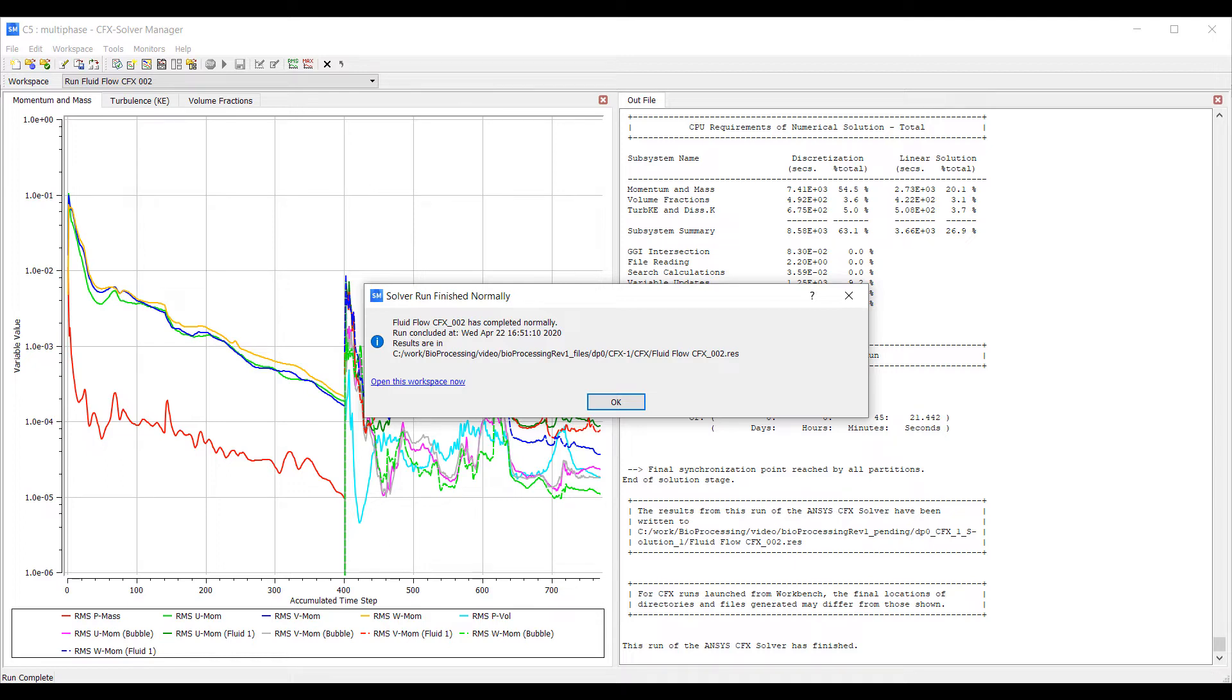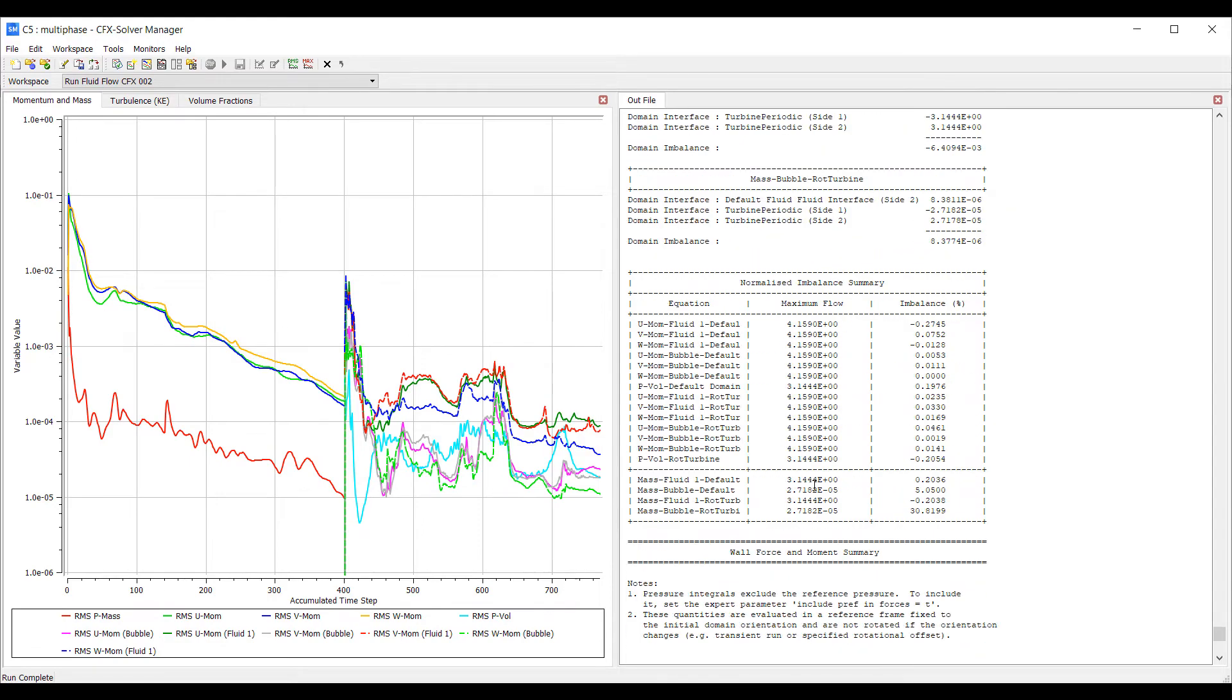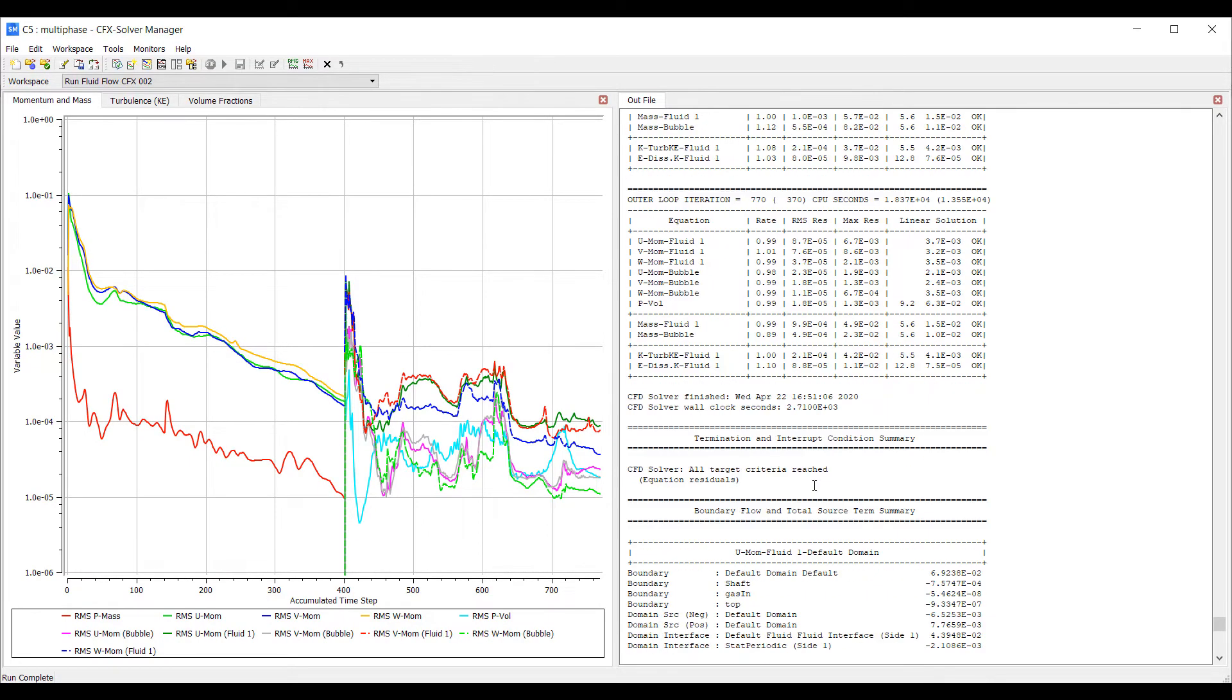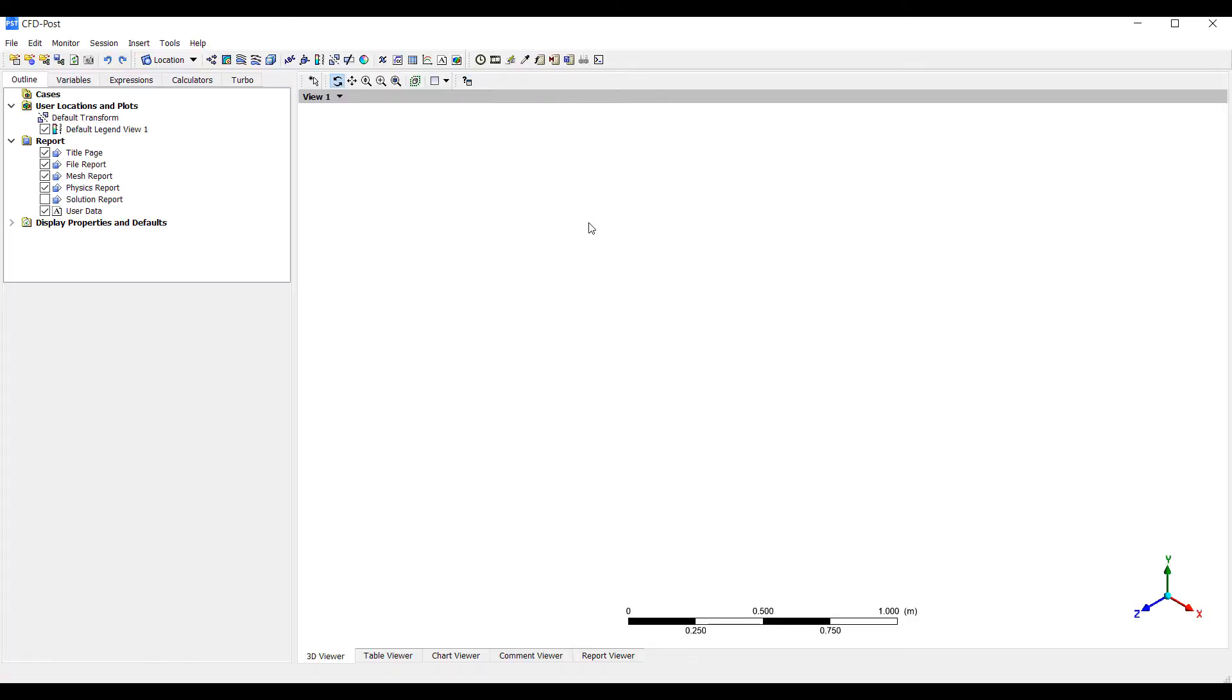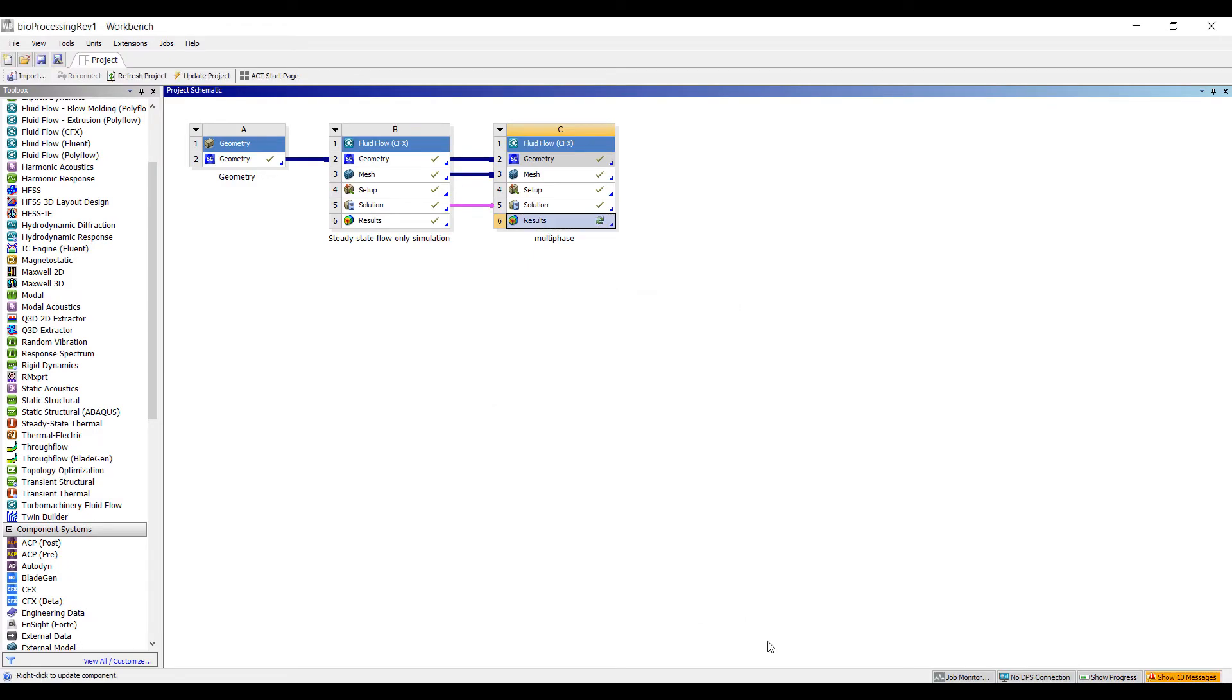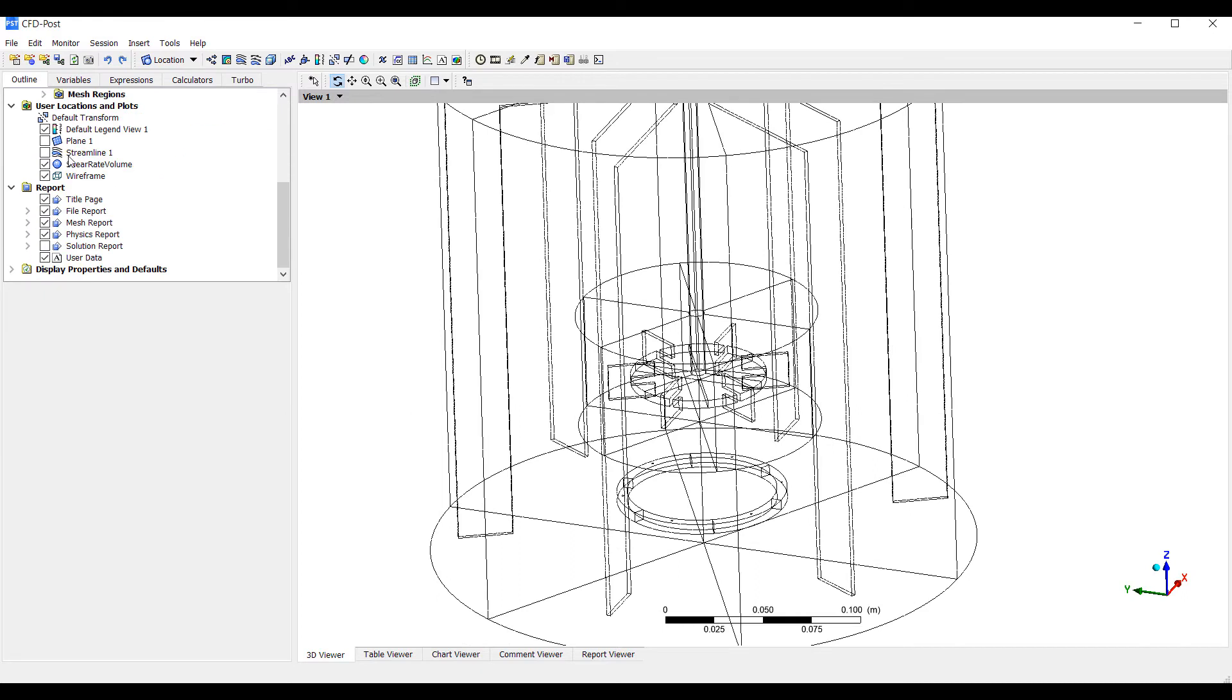The simulation has been completed. It took 45 minutes. And it looks like a convergence criteria was reached. So let's take a look at the results. This is the model.